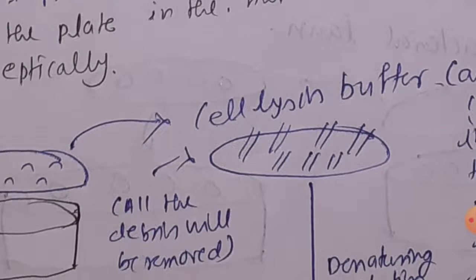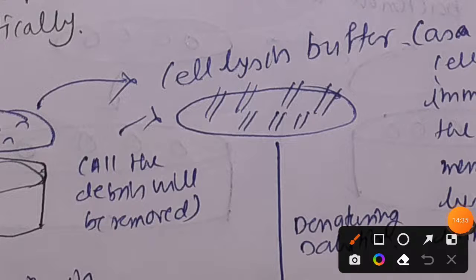So now DNA will appear instead of cells, as you can see in this picture. Okay, now we will apply a denaturation buffer. The denaturation buffer will cause the denaturation of those double stranded DNA in immobilized condition, and it leads to the generation of single stranded DNA molecules. Then we will wash them, and only one strand will remain.